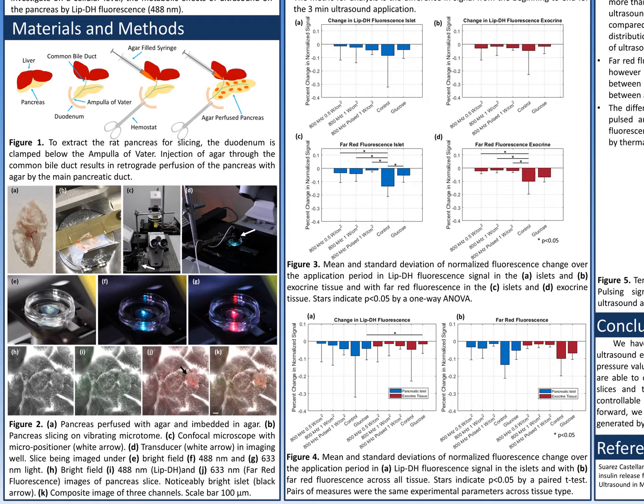The highlighted islet makes it very easy to see motion, which allows us to exclude trials that have excessive motion, as this type of motion is difficult to correct for, since it is random and non-periodic, unlike motion in, say, beating heart cells.